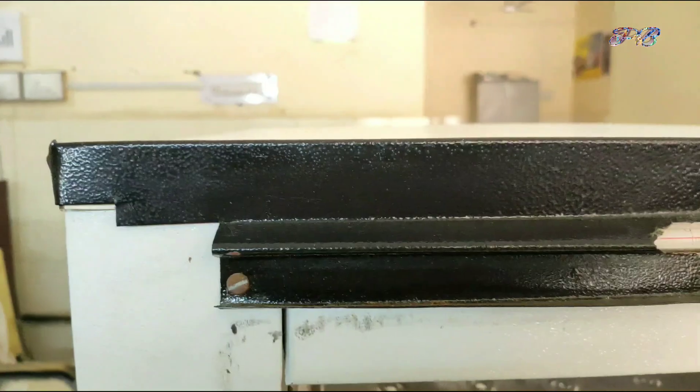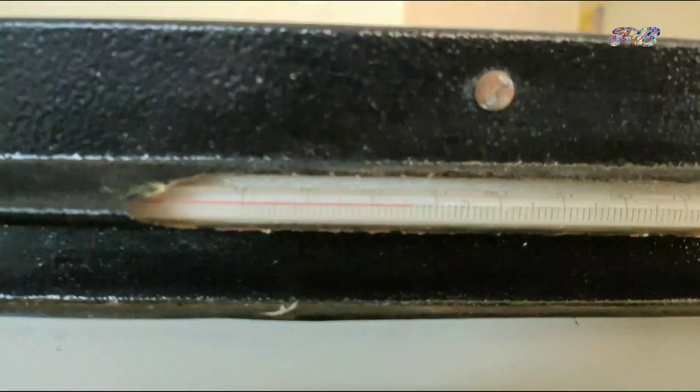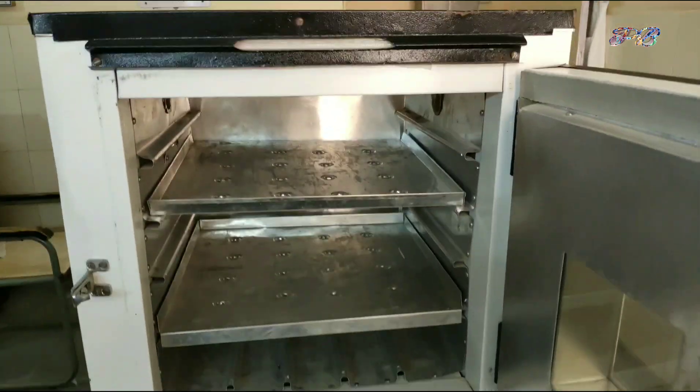The temperature range is 30 to 80 degrees centigrade. It is available in both online shops and the price range starts from 5,000 as you see on the screen. If you want to buy, the link will be available in the video description. You can purchase from this link.